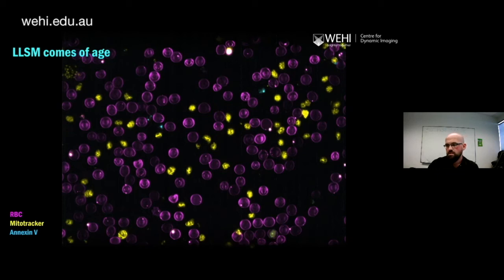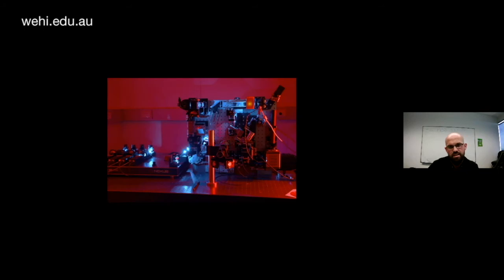So that's 2020. Now what about 2021 and the future? Because the Zeiss system has really filled the void and brought something to the table, which is going to absorb probably about 90% of the existing applications on our home-built system, what do we do with the home-built platform? And this is the beauty of having customizable tech, because here you've got a microscope. It's not just a black box that becomes redundant as soon as the next toy comes on the market.